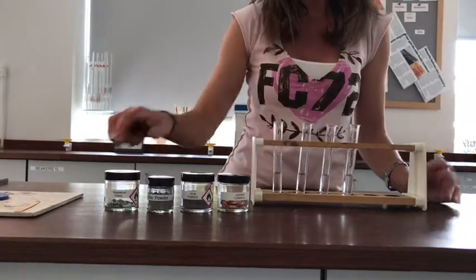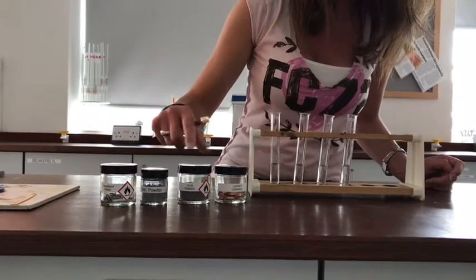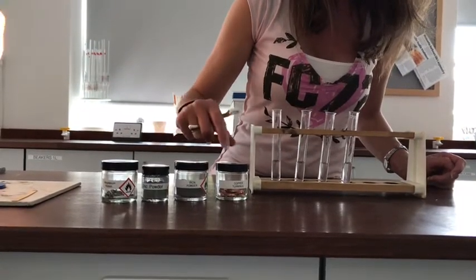We'll just look and see if we can get bubbles. The metals that I'm testing are magnesium, zinc, iron and copper.